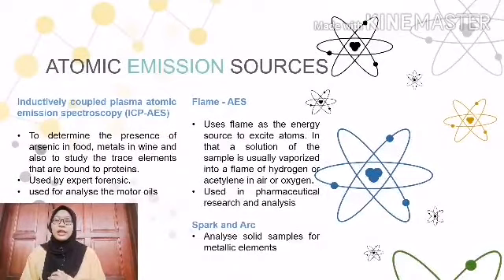For flame AES, this method uses a sprayed solution or gas. The flame heat evaporates the solvent and breaks the chemical bonds of the analyte, so free atoms of the material are produced. Flame AES is frequently used in studying alkali metals for pharmaceutical research and analysis. ICP-AES is used to determine the presence of arsenic in food, metals in wine, and also to study trace elements bound to proteins. It is also used to analyze trace elements present in soil.